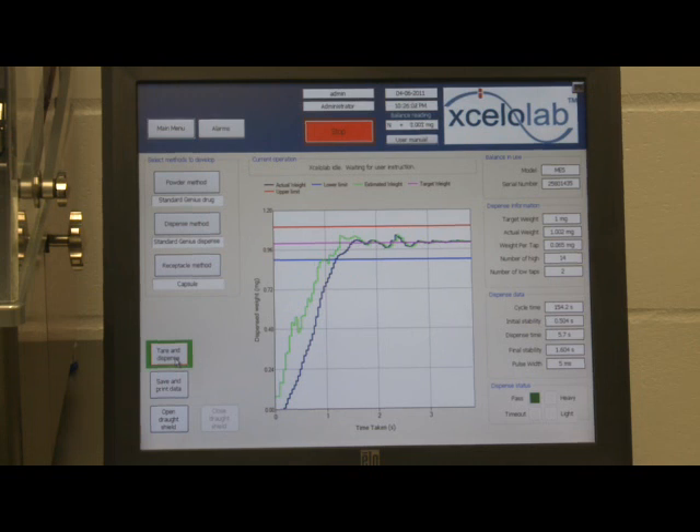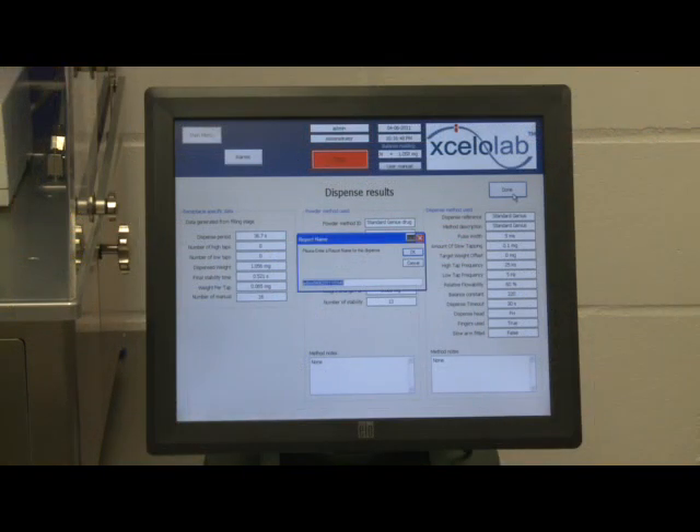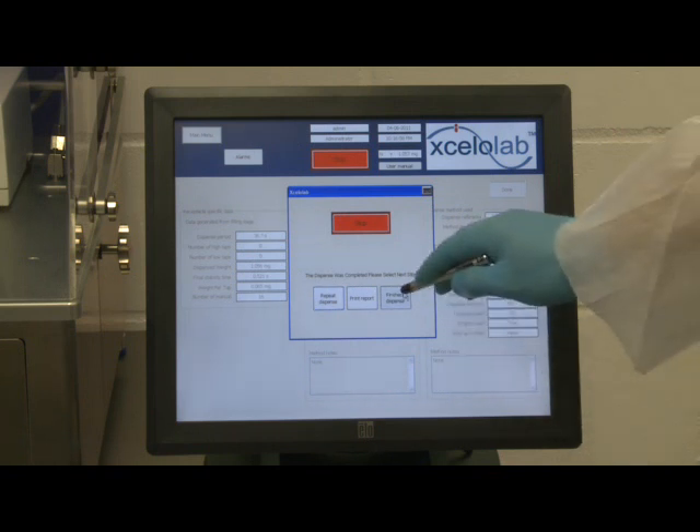Further information on the method development mode is available from Capsugel. For each mode of operation, receptacle, powder and dispense method notes can be stored and comments added. The Xcelolab dispenser exports data to a text file.